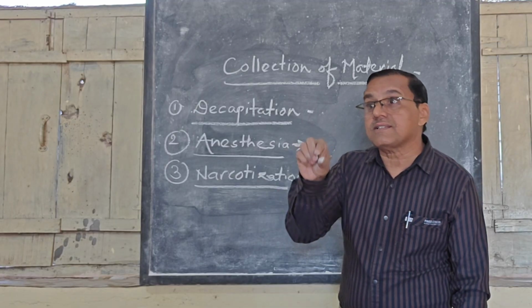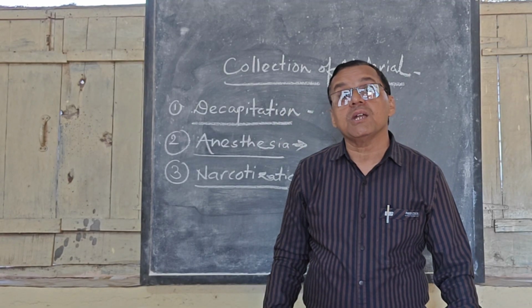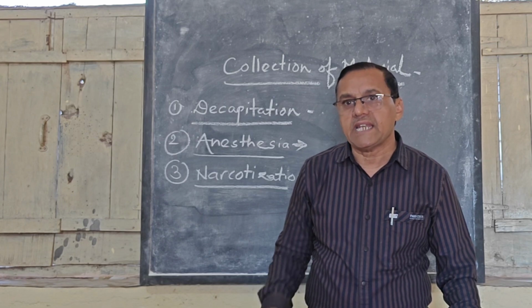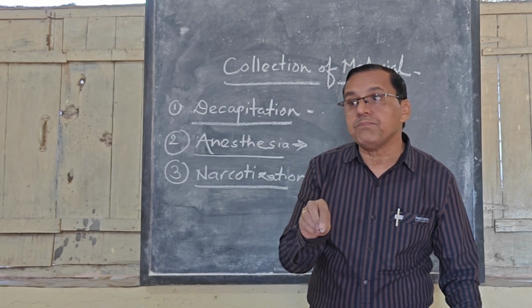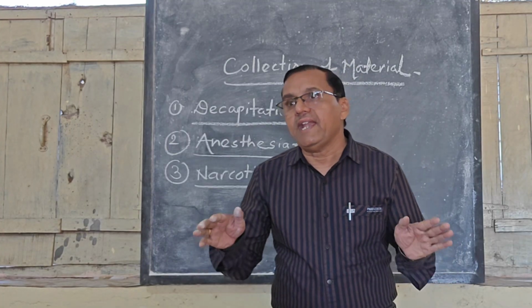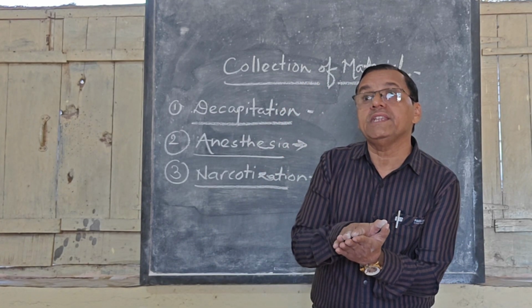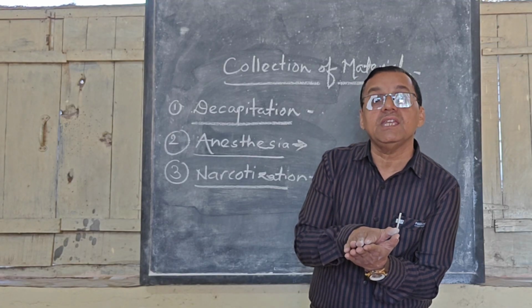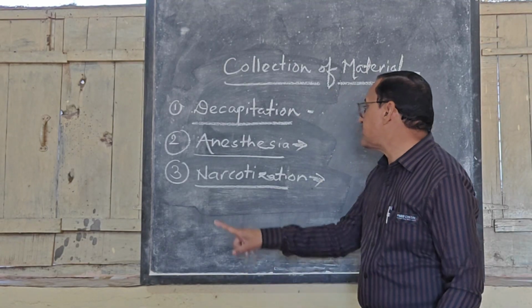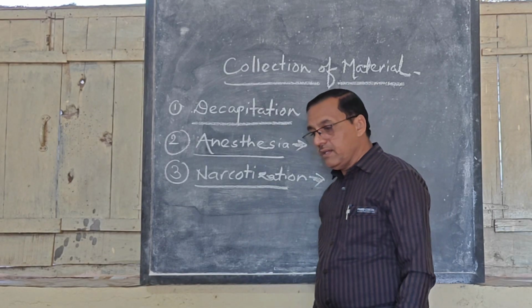So these animals can be put into magnesium sulfate solution, so that they get relaxed, and after they are fully relaxed you are able to mount them on the slide. This process is called narcotization, right?